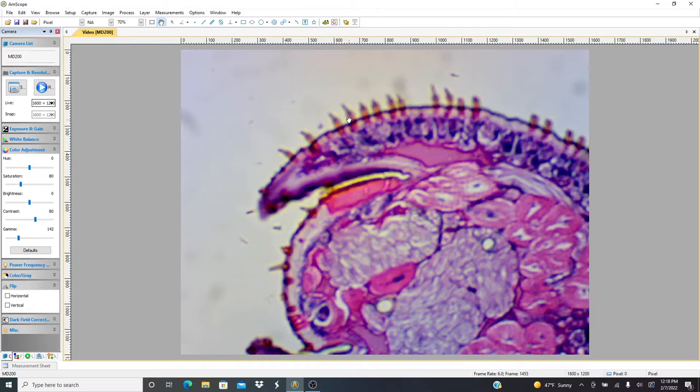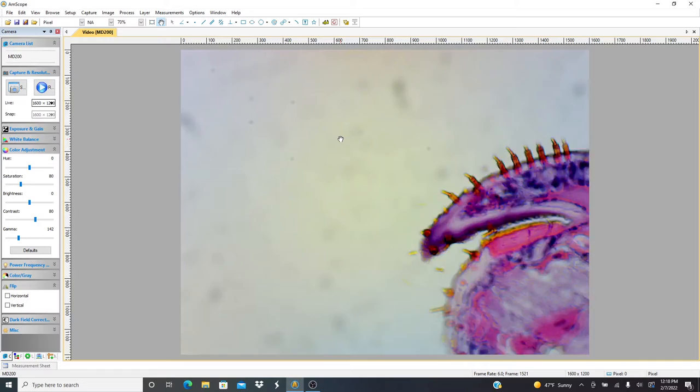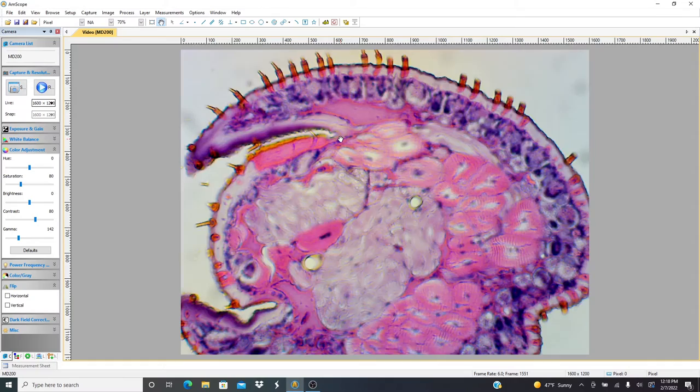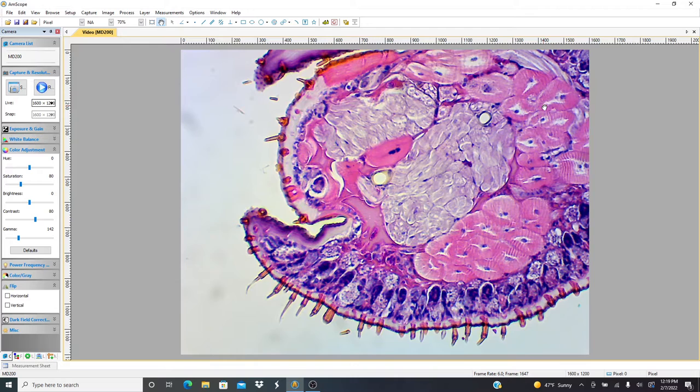You can see it's got these spikes right here on the outer aspect of the leg, which I don't think I could see grossly or without a microscope. They're probably about 10 micrometers in size. Interestingly, you can see these tissues here are skeletal muscle. You can tell by the cross banding. Obviously these cells here are what produce, I guess, chitinous sort of spikes. I'm not sure what they do otherwise. I have no idea what this tissue here is, but it looks pretty cool.